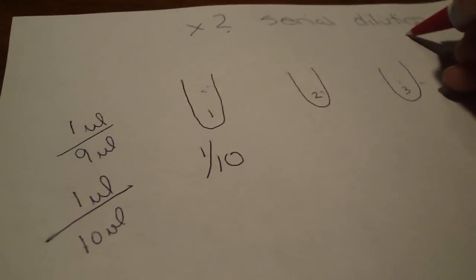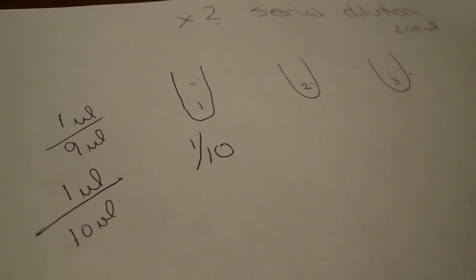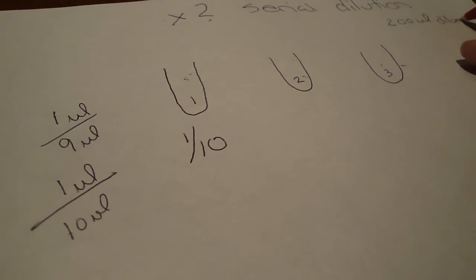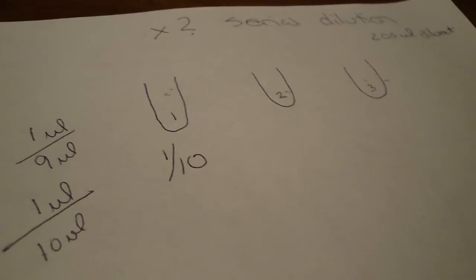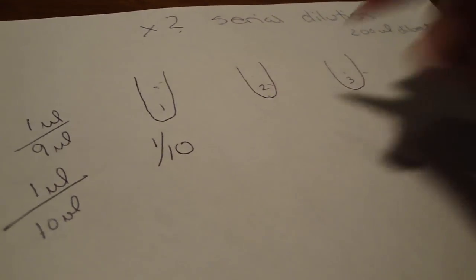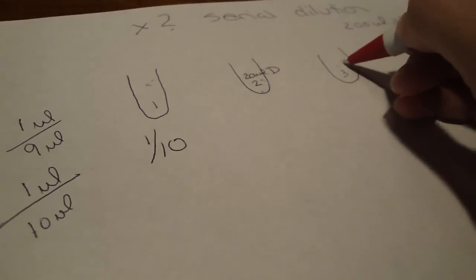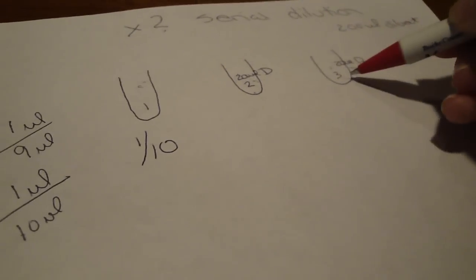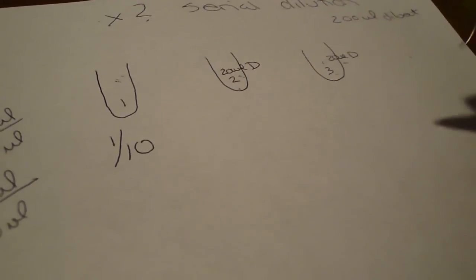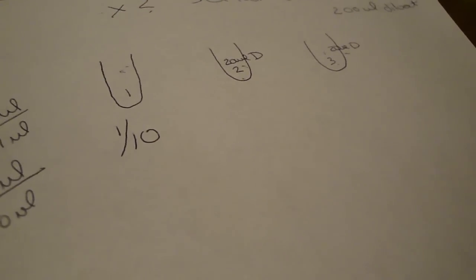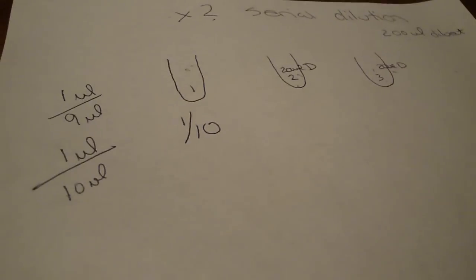We're going to start with, we're just going to use 200 microliters of diluent. You would take your pipette, put your tip on, go into this and you would go ahead and in tubes two and three, you would put 200 microliters of diluent. You could go out farther, you could go out to infinity and you would put 200 microliters of diluent.